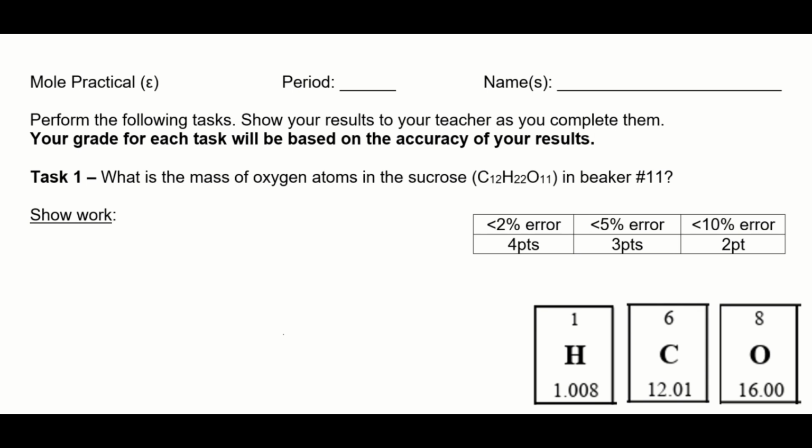I'm going to walk you through today's lab practical. There were over 30 versions I've accumulated over the years, but I'm going to show you using Epsilon. You probably didn't have that form, but even though the chemicals and substances may have been different for you, the tasks were the same for everybody. That's what I want to emphasize.